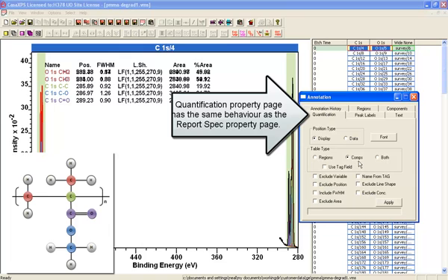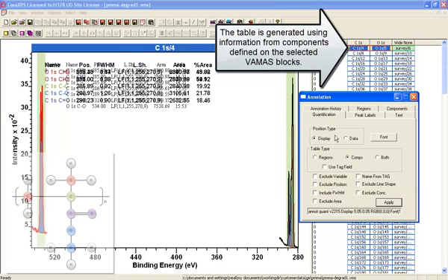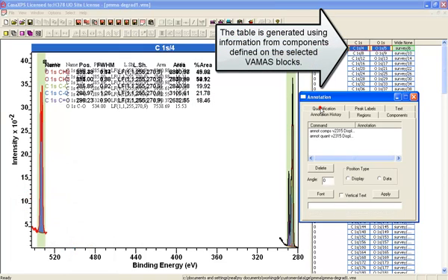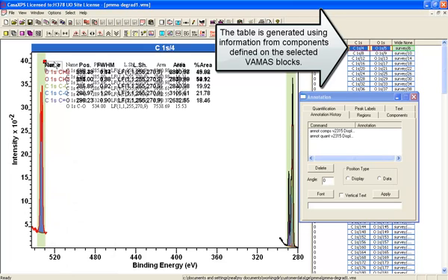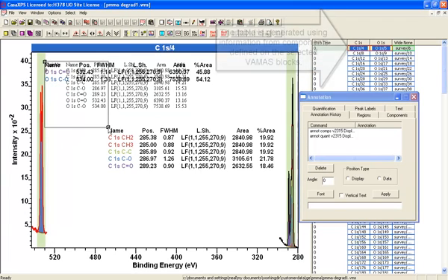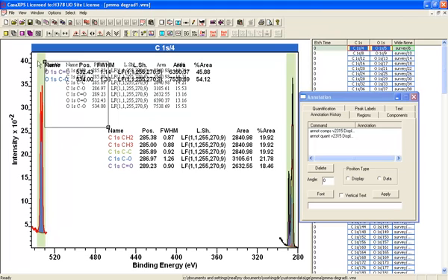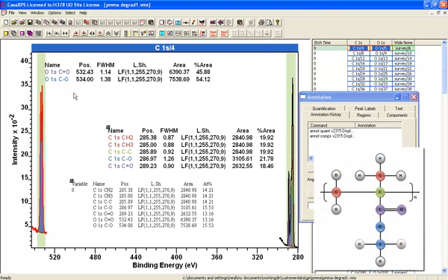We'll select the components option and press apply. You can see now I've got more than one table defined, so I'm going to move one of them out of the way and the other one out of the way as well. Now you can see that there are three tables involved — two sets of spectra and three tables.